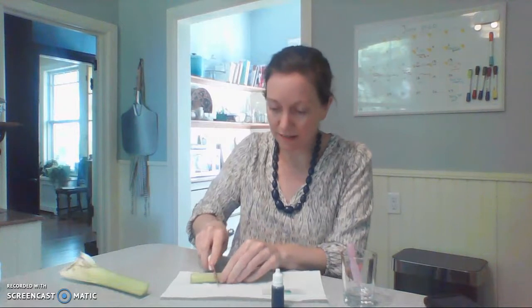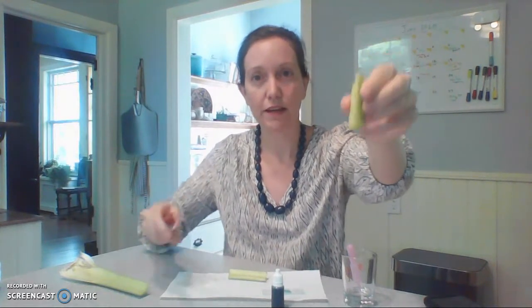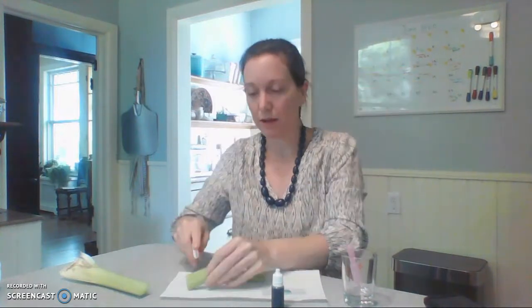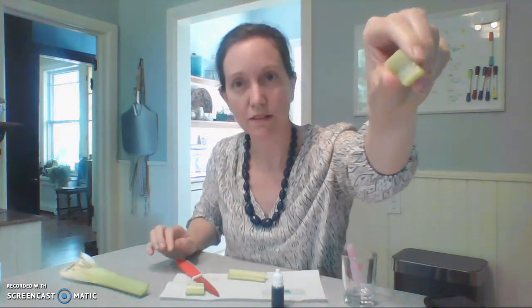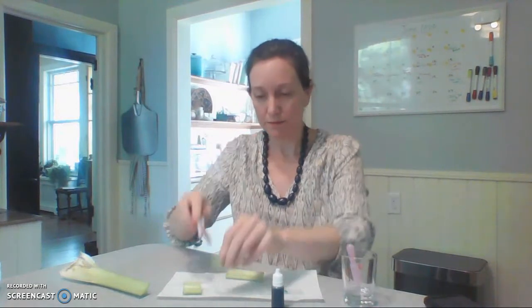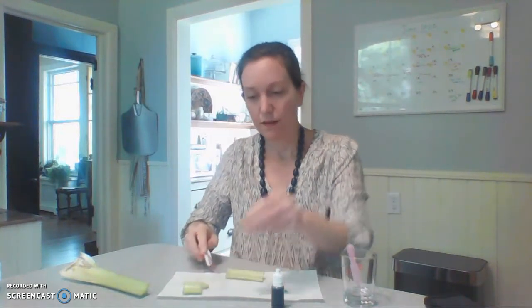For a longitudinal slice, I made a little piece of celery. I'm going to slice it this way — I want to make it about one centimeter long. Then I'm going to cut it down the middle.